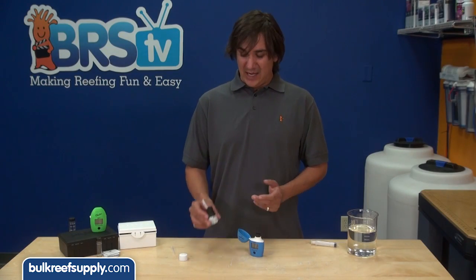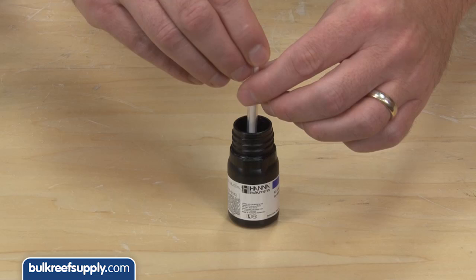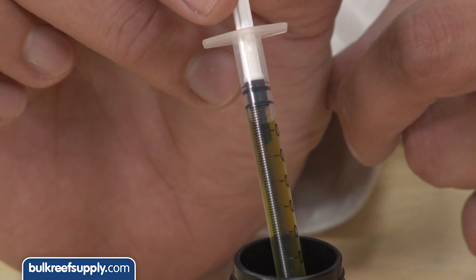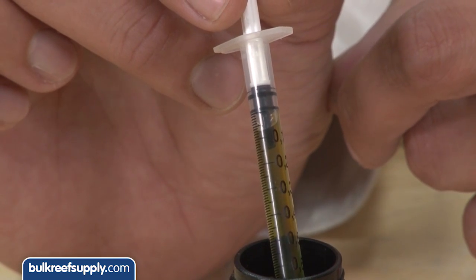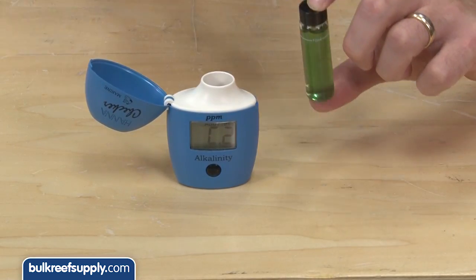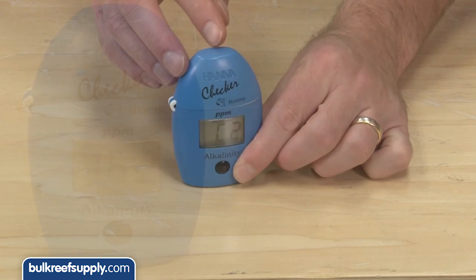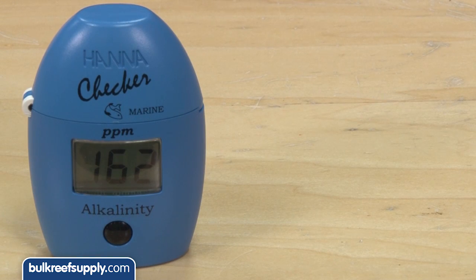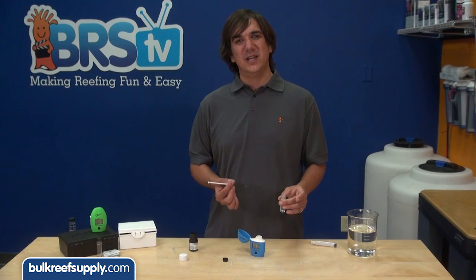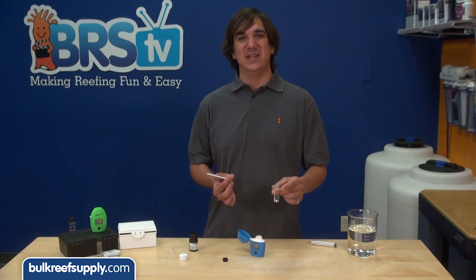Next, open the reagent bottle and draw out one milliliter of solution — just pull the plunger back until it hits the one milliliter line. It is perfectly normal for there to be a small air bubble at the top, so ignore that. Add the reagent to the cuvette and invert it five times to mix. Place it back in the checker and hit the button. In a few seconds it will give you a reading, which you can multiply by 0.056 to get your DKH. The whole thing literally takes less than a minute and is much easier than titration-based test kits.